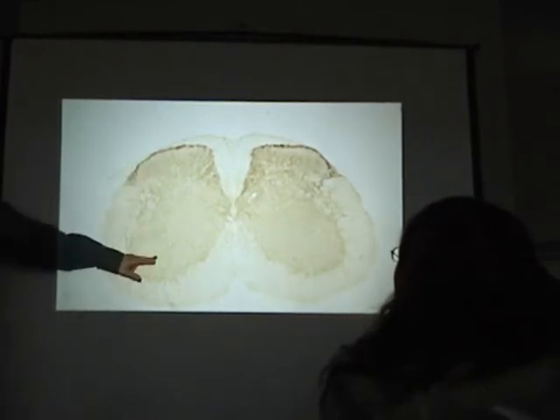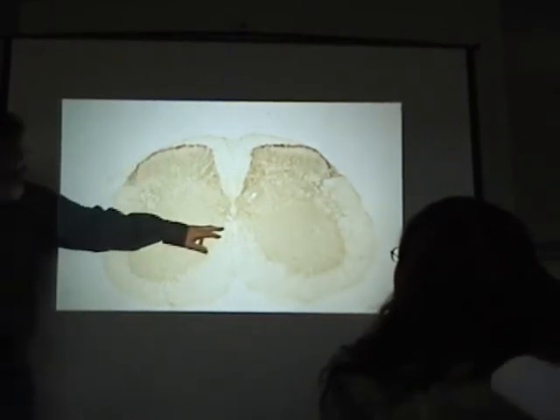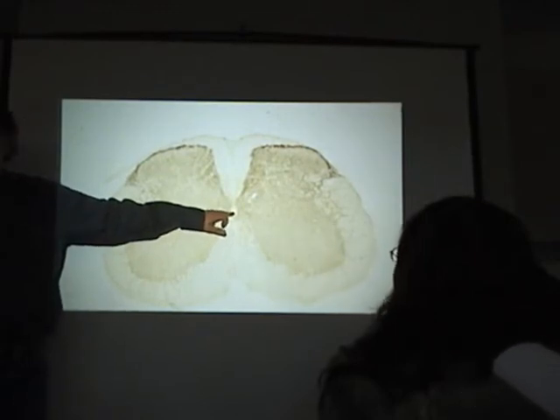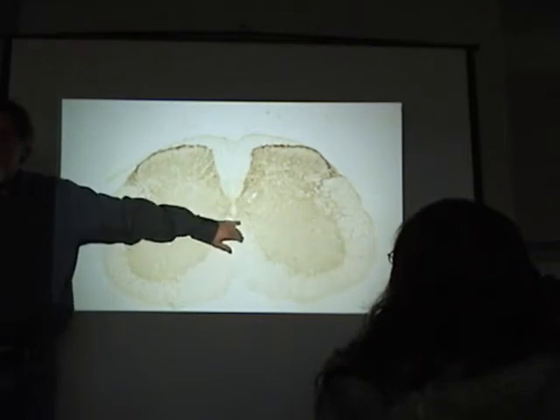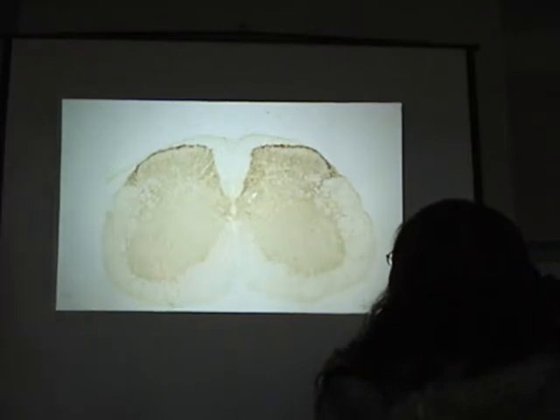All right? Down here, what's this structure right here? And then the ventral median fissure helps you orient yourself. All right?